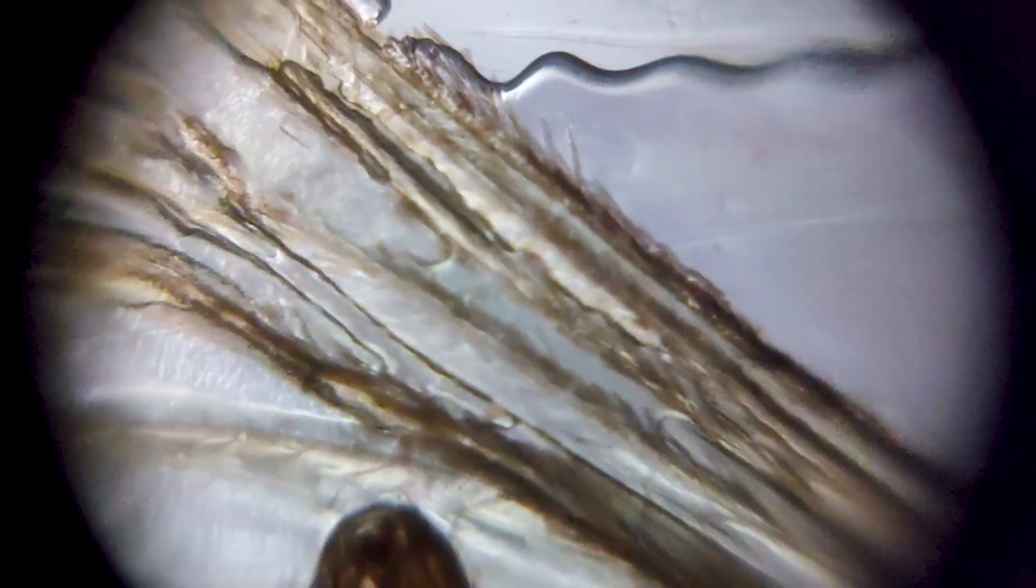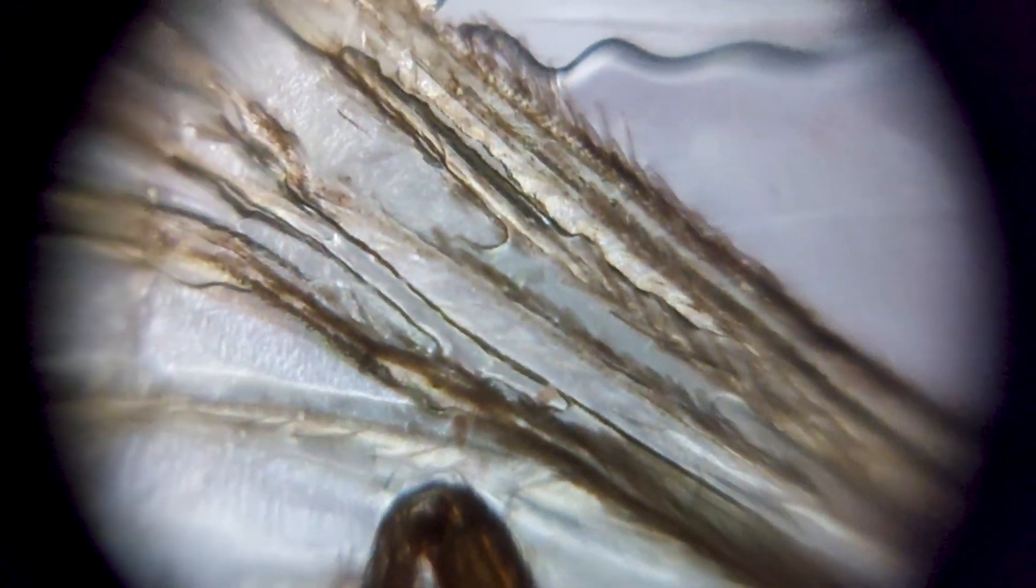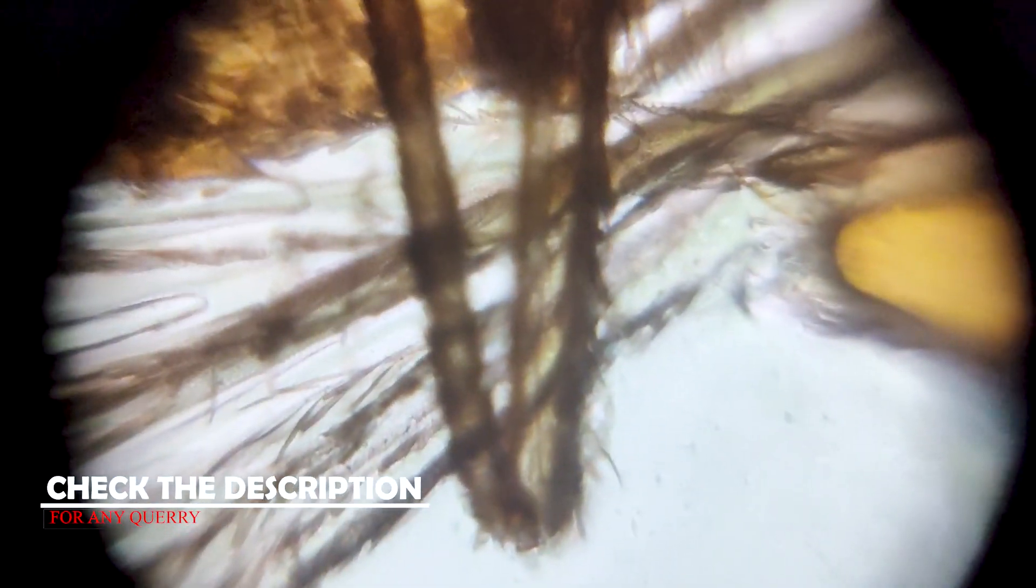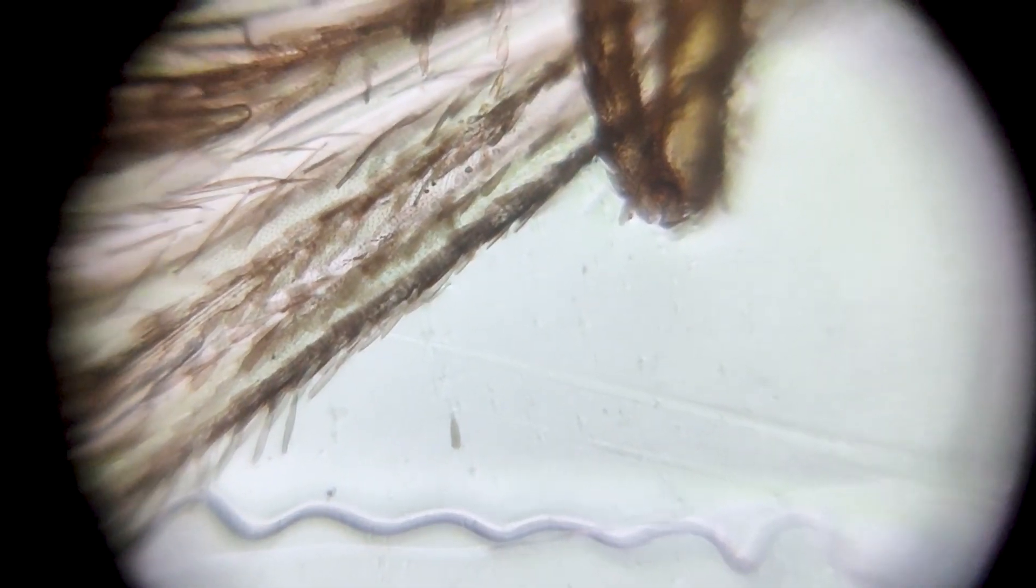And here I have a close shot because I recorded it. You can see the wings and the legs are both together. And this is the other side of the wing area. If you look at it, you can see the legs and this is the wing portion.